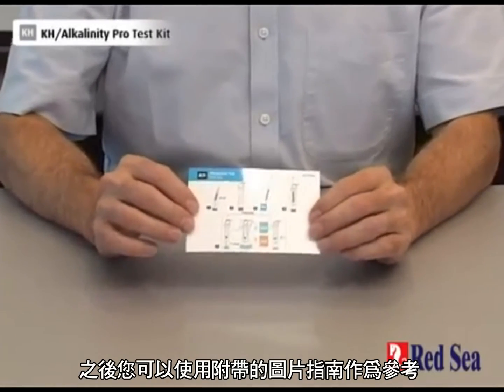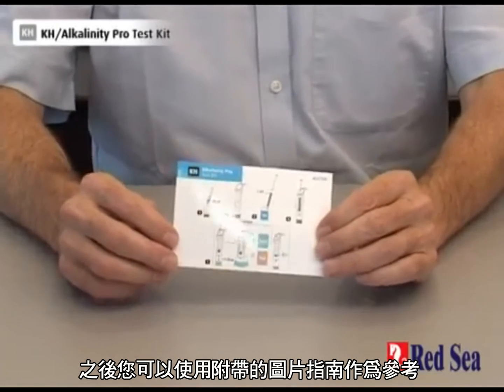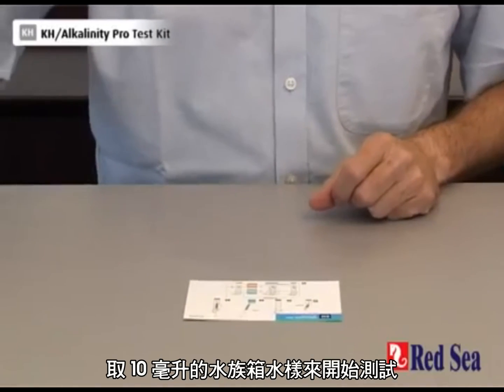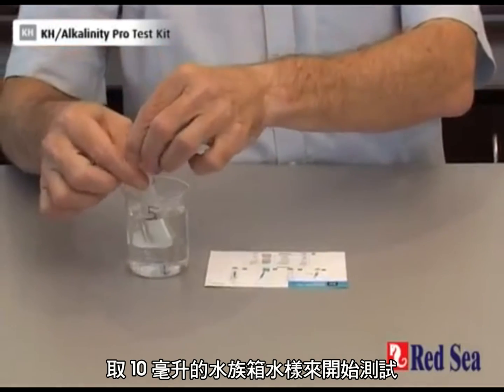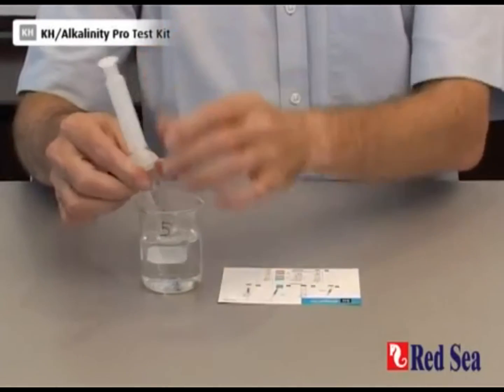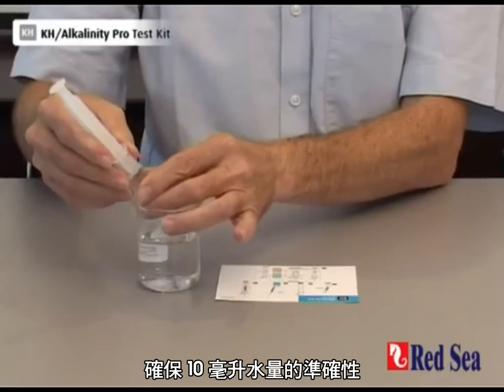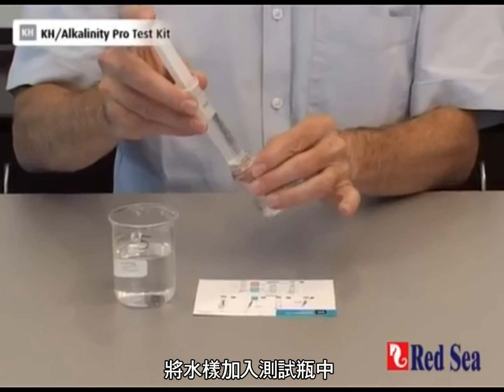After that, you can use the graphic quick instructions, which are also provided as a ready reference for carrying it out. To do the test, we start with taking 10 ml of the aquarium water to be tested. Make sure you're accurate in setting the 10 ml in the syringe and transfer it to the test valve.